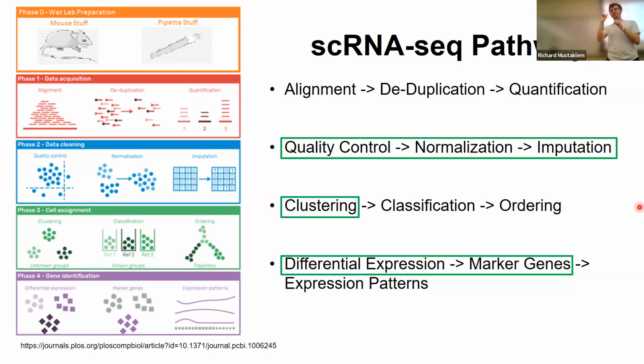It has a gene name with the cell, and then the identifiers, like where it came from. That's all it is. And then we're going to be taking that and making a map out of it and showing, okay, this cell is really similar to this cell. This cell is not similar to this cell. And this can lead to breakthroughs.